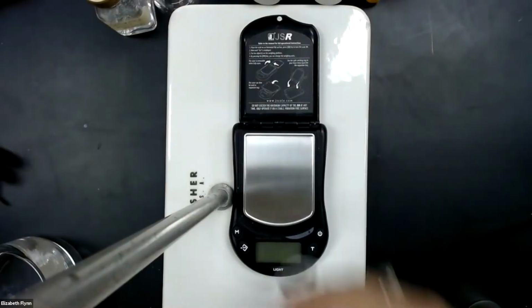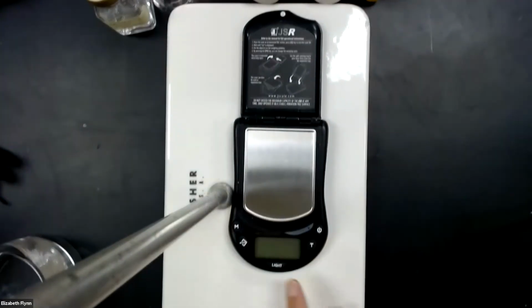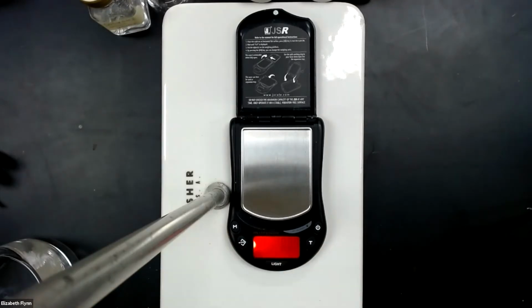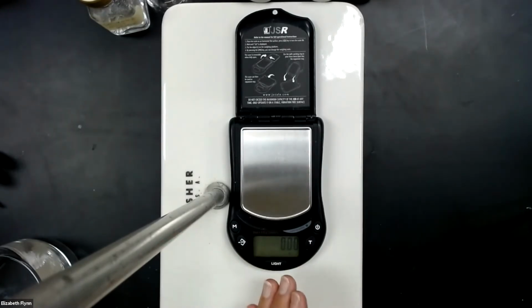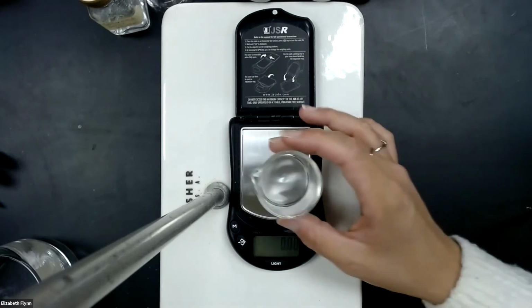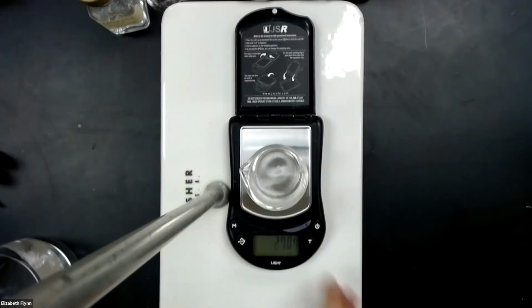All right, so this time we're going to tare a 50 milliliter beaker by first turning on the balance. And be very careful with these balances because they're super sensitive. If you spill anything on them, wipe it off right away, please. And never overload it. That's super important as well. But with the things that we have to work with today, you shouldn't have to worry about that. Okay. So when it says to tare a 50 milliliter beaker, it means zero it. We're zeroing it on the scale. We push T for tare.